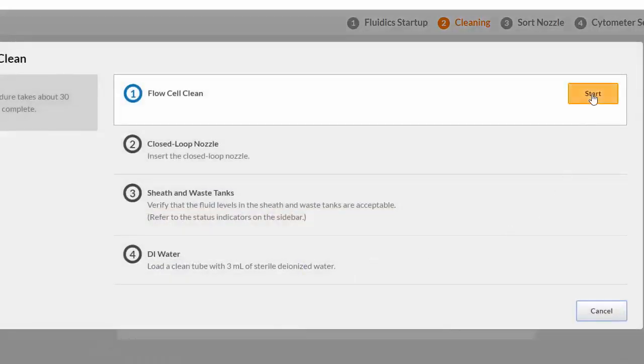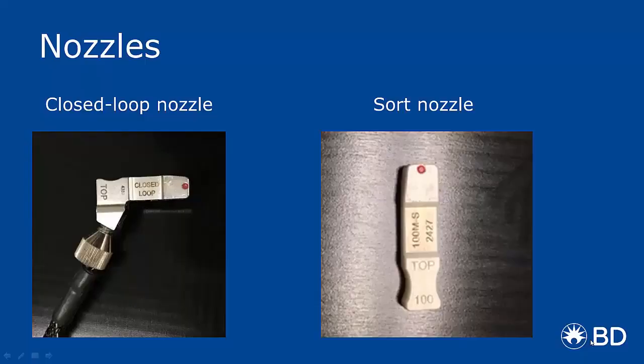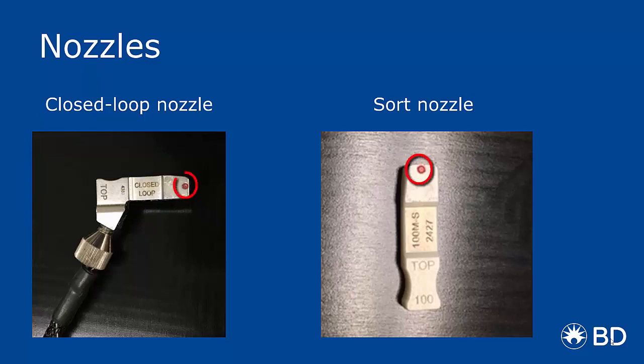The software prompts you to insert the closed loop nozzle. This nozzle is used for cleaning and shutdown procedures. The closed loop nozzle has a connected wire. The sort nozzle does not. Both nozzles have a tiny orange O-ring with the word Top imprinted.